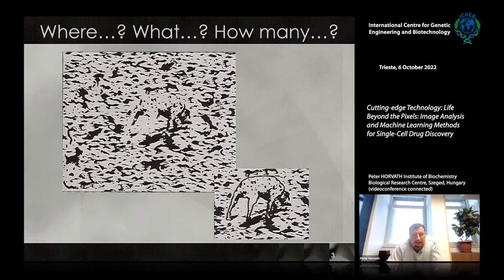Because I gave you something. This is called prior information, because I've shown you what to look for. So if we know more or less what we are looking for, then the question becomes much easier. And this is something I'm going to use in my entire presentation. It's also called prior information. So the more prior information we have about the system, the easier it gets to find a solution. And then I still have two of these funny slides before I go to more difficult equations.